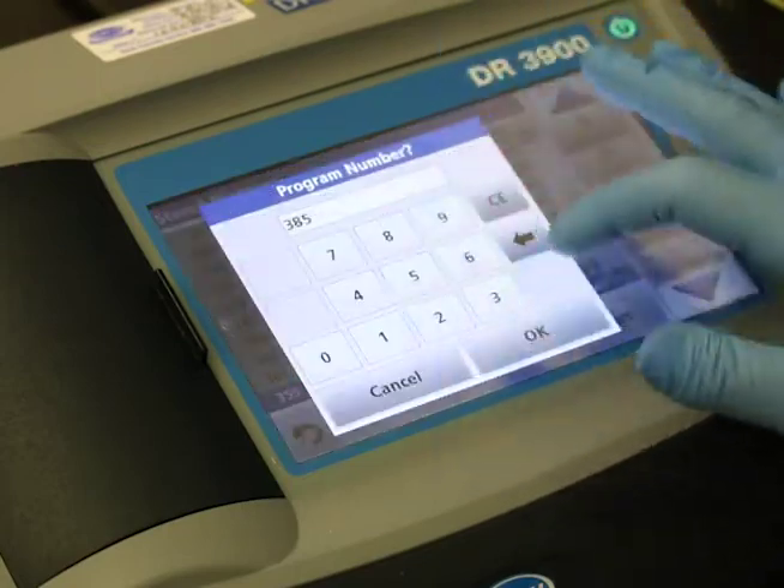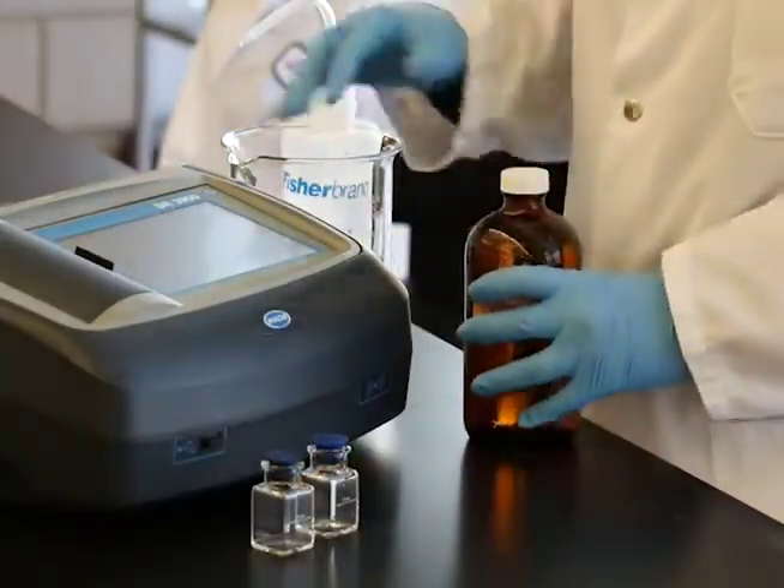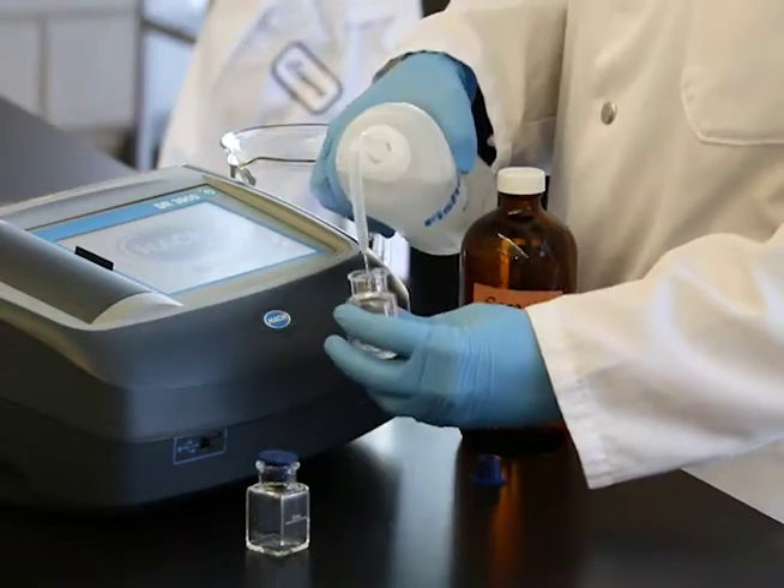Start the program for nitrogen ammonia on the spectrophotometer. Sample cells, adapters, and light shields will be indicated as appropriate by your instrument manufacturer.